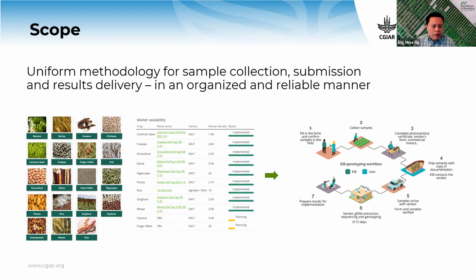I can already name a few services that we potentially would like to bring onto that platform, including our newly established genomic resequencing services, whole genome assembly services, as well as some other quality analysis services. Those are all in the pipeline and should be made available on the same tool or marketplace in the very near future. Now, why that switch?